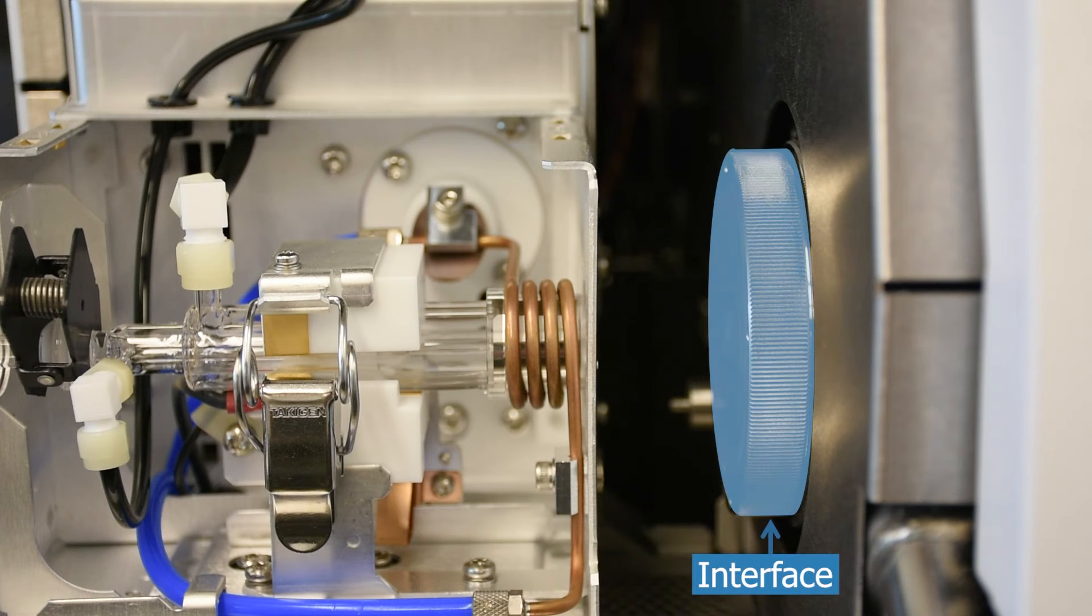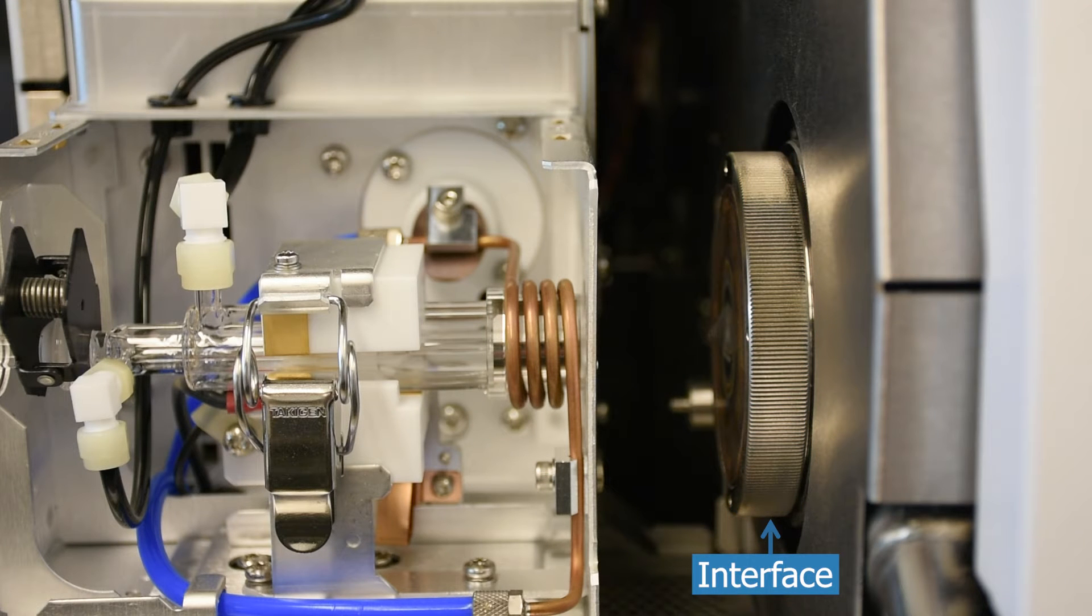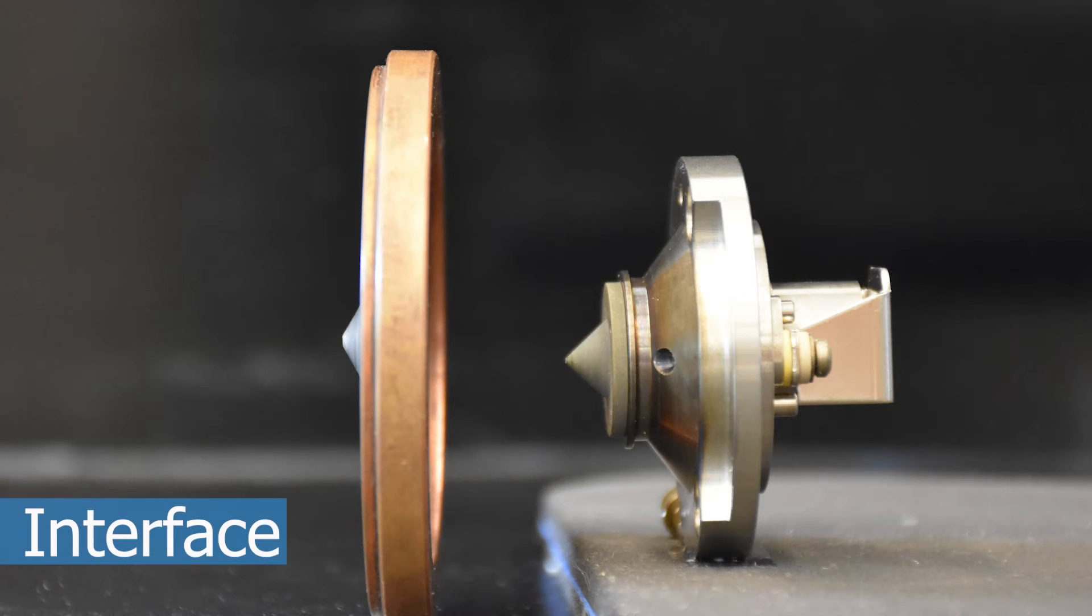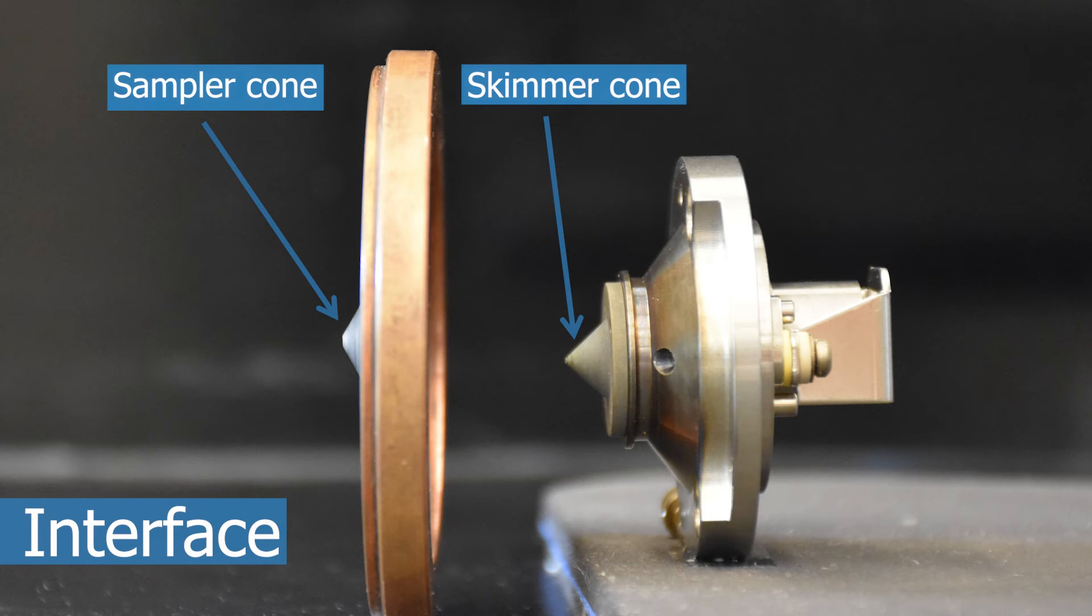The resulting analyte and argon ions move towards the interface, which couples the plasma to the mass spectrometer. The interface consists of two cones, a sampling cone and a skimmer cone.